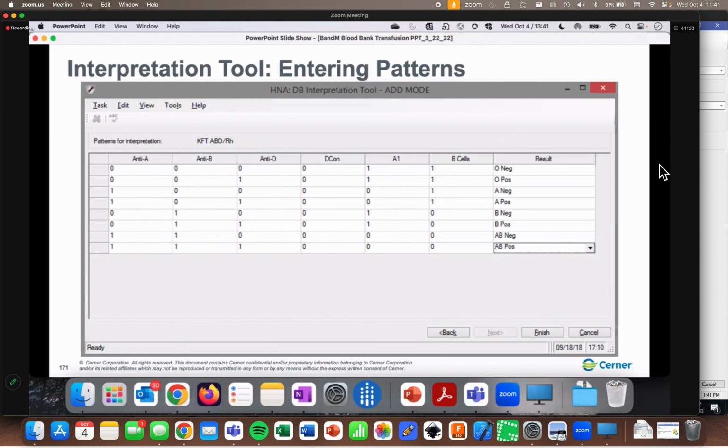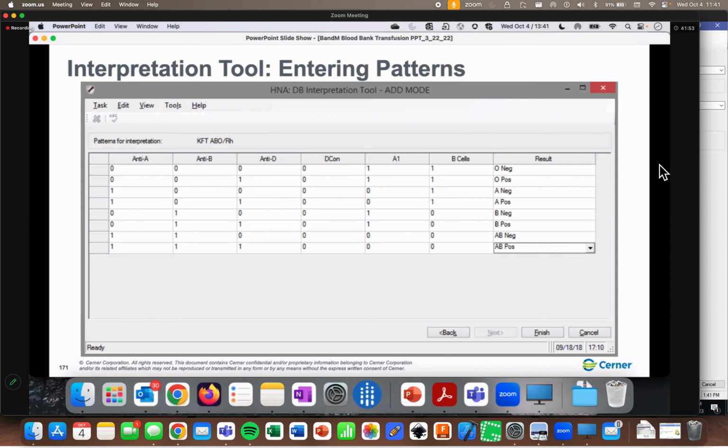It has to do with the way they're ultimately coded, because of course most computers rely on binary, ones and zeros anyway. So numbers just make more sense. It's why in our database, we have a whole bunch of code values. We have a whole bunch of table IDs, because that's just easier on the system. So by extension, when we're having to process interpretations, it is a bit easier on the system if it has a number to represent its different patterns.